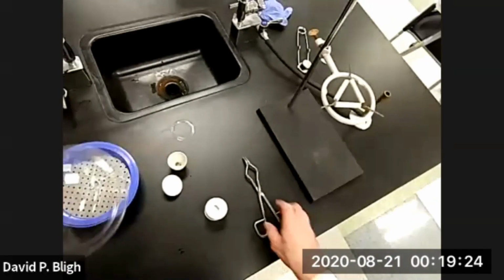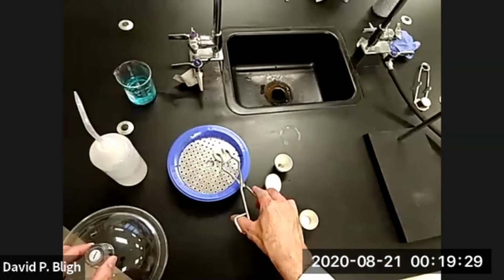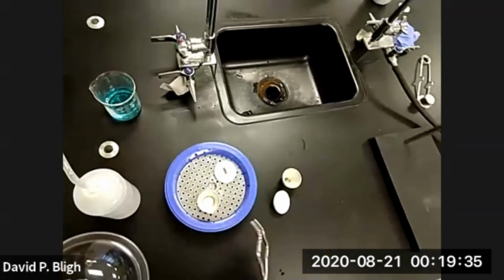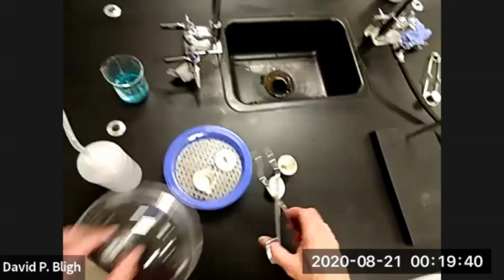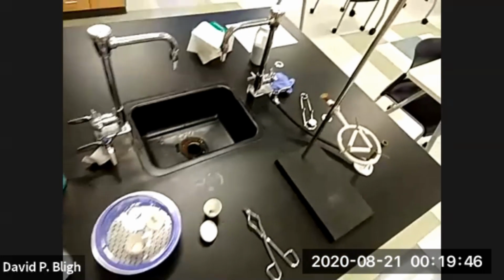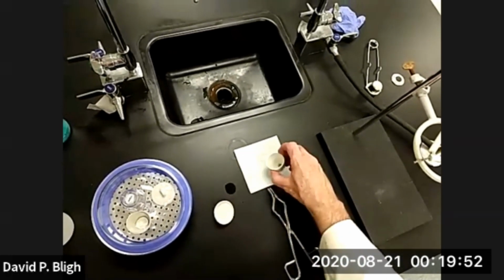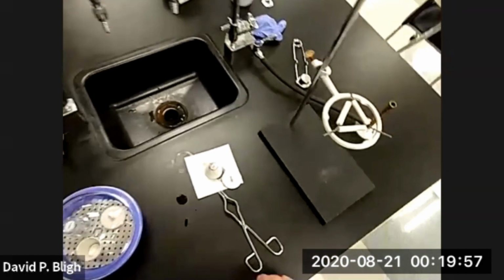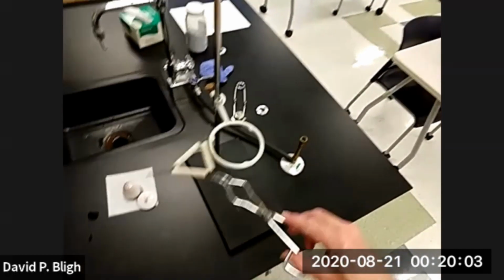Okay. That's about a minute. See, there's not much difference between before and after that you can tell just by inspection. That cool. Let me get a chem wipe and turn this thing over so it can drain. There we go. That'll cool it faster. And separating these things from one another will cool them faster as well.